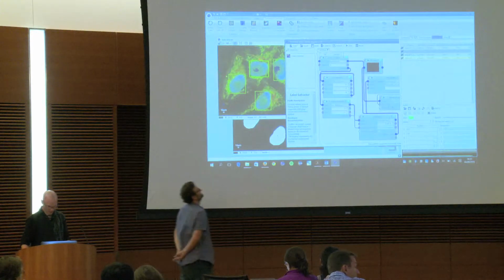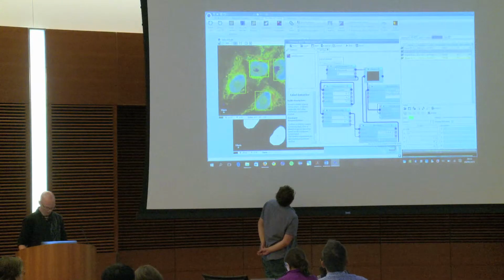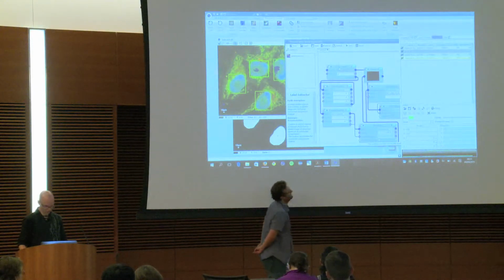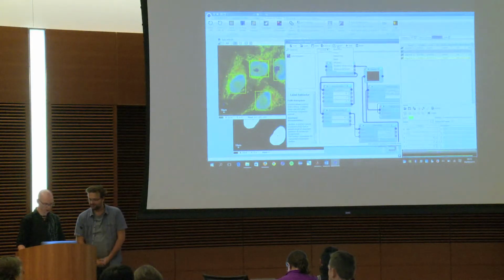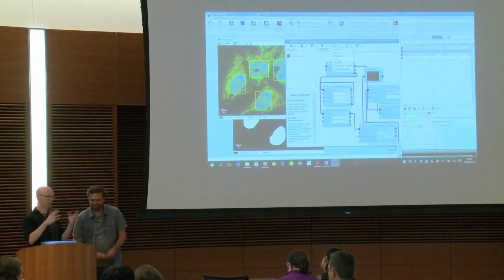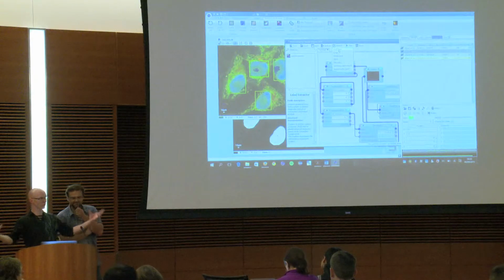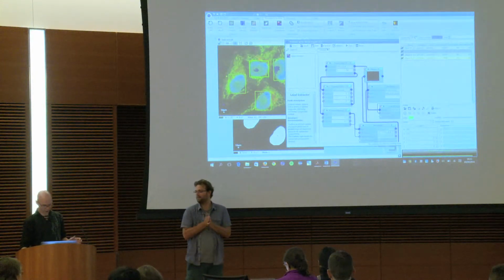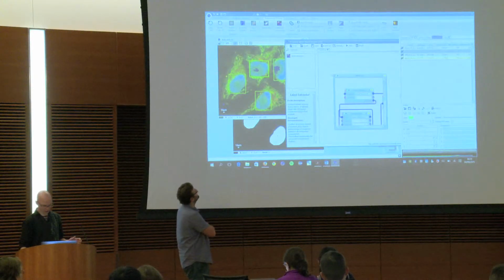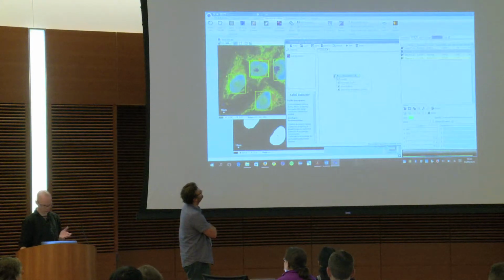Yeah, you can change the name of the block, but that is not what we want to do here. But when you are done with a protocol, you can click on this embed, and you can see that you have different kinds of embedding, including file batch processing. You can embed in a workflow, and the workflow will be created as a simple block. I rely on that, and then you can even reduce it here. If you collapse this block, you see it's very small.